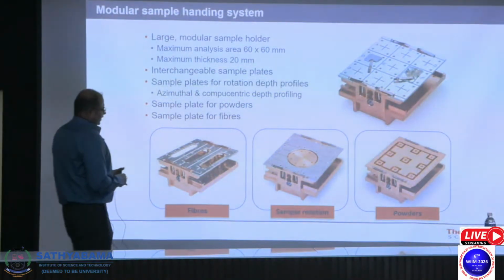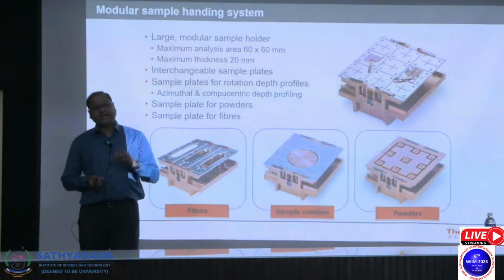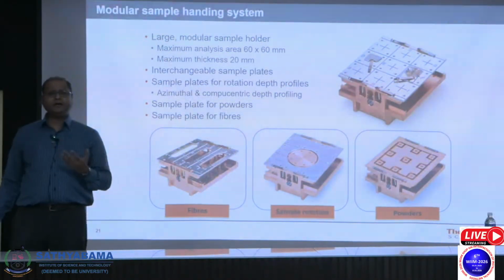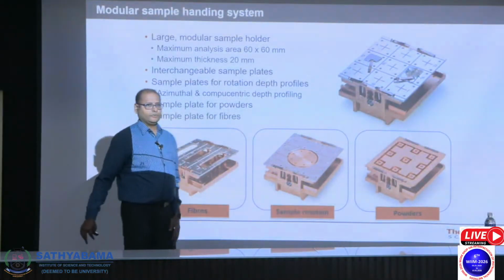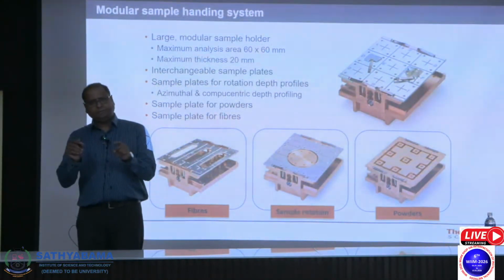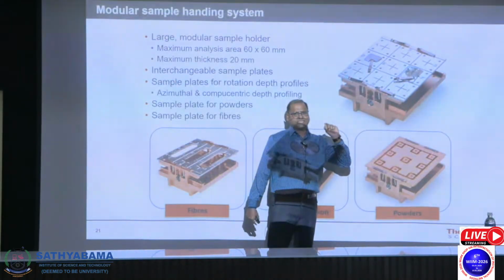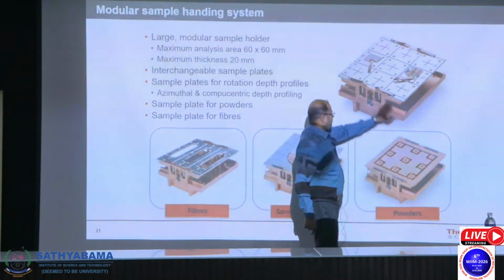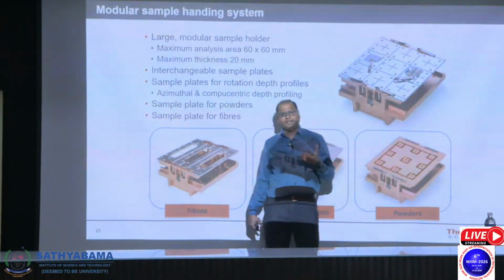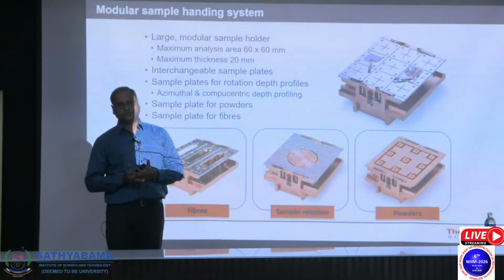Now moving forward, it comes to sample handling. When you take your sample to an XPS lab, not every sample is of the same geometry or same nature or same shape. So depending upon your sample, you should select the holder you are going to use. For example, if you have a nice bulk sample, you can make it into small pieces. You can use this multi-specimen holder. You use a double-sided carbon tape, stick your sample, and in fact, you can load up to 4 samples in this quadrant. So at a given time, you can even load 36 samples in one go on a K alpha instrument.